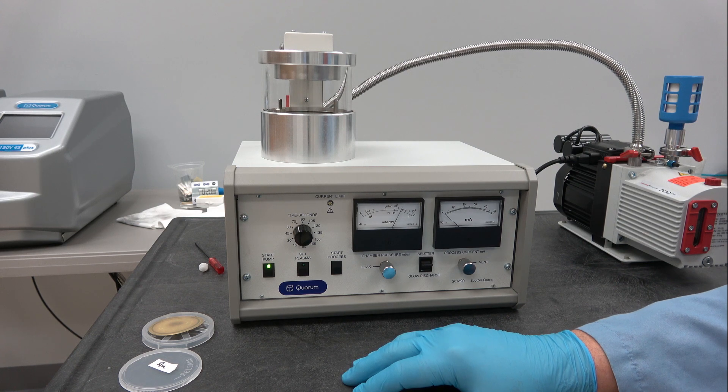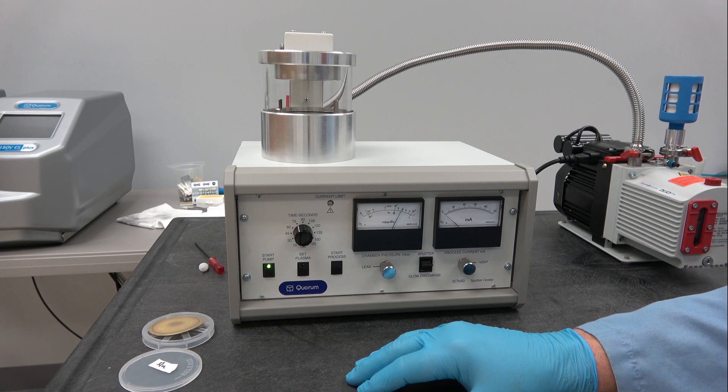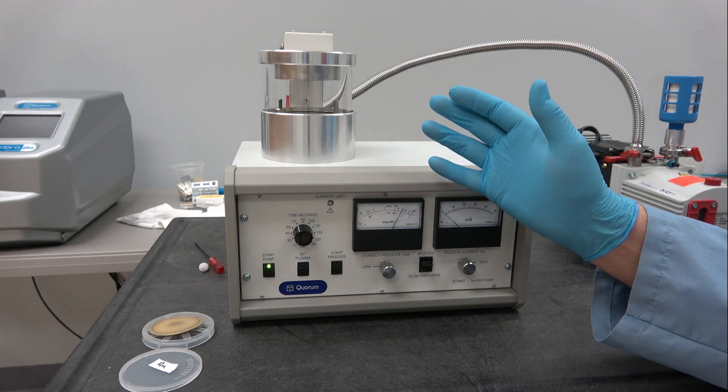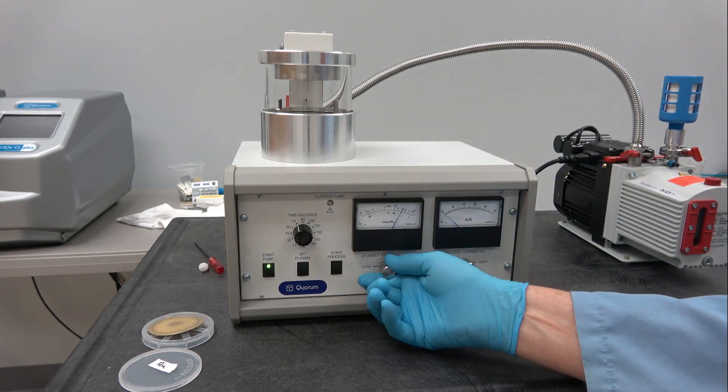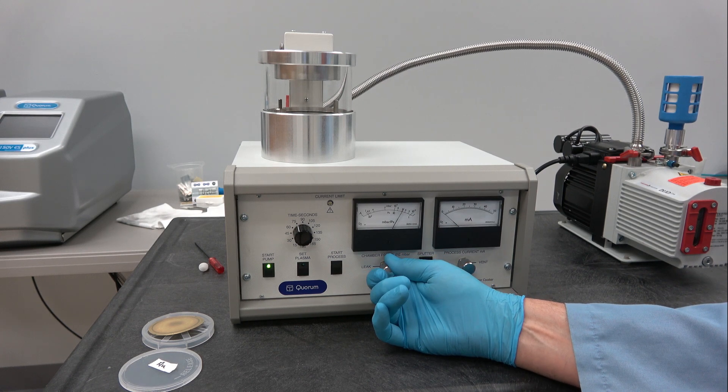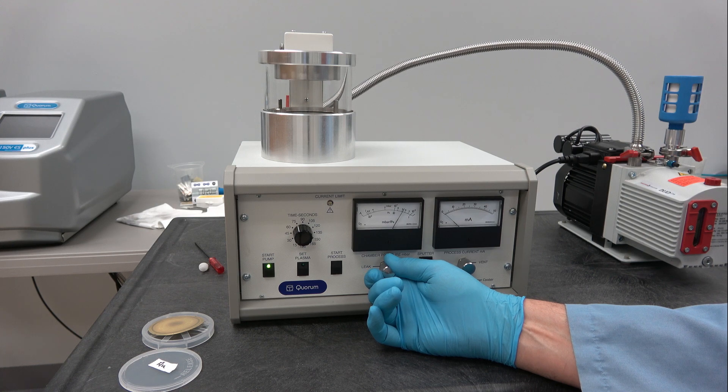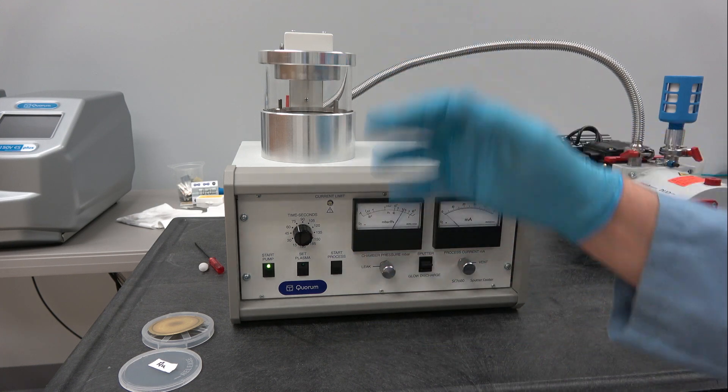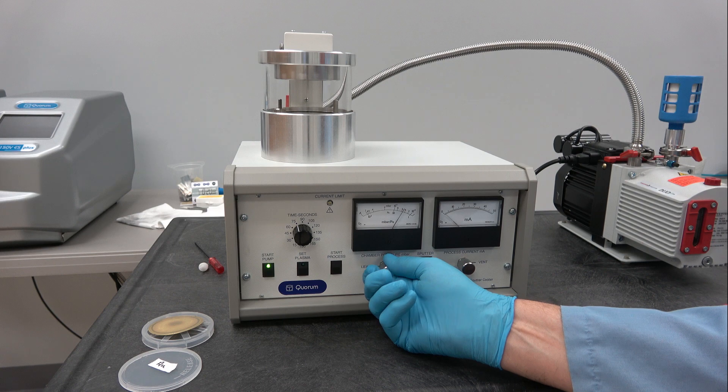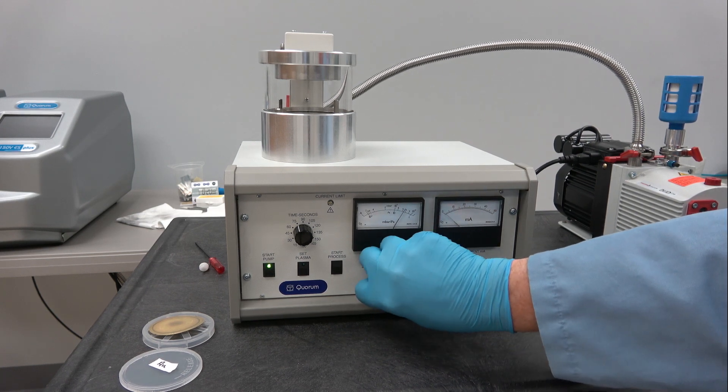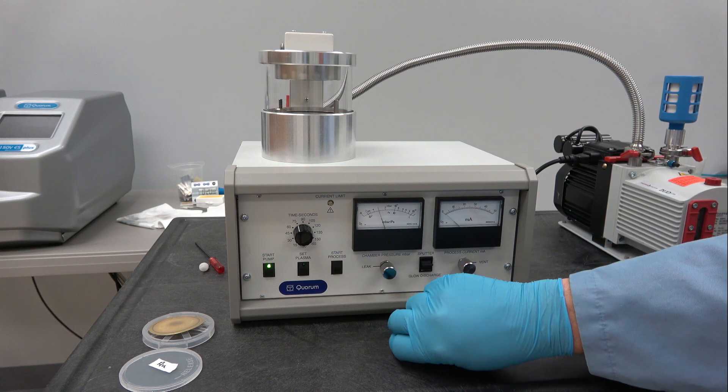Now usually what I like to do during the pumping process is I like to flush the chamber a few times before lighting a plasma. This is to drive out water vapor which is clinging to the inside, any outgassing of the chamber. This usually will improve the vacuum quite rapidly.